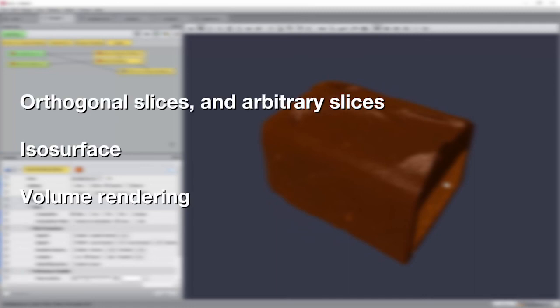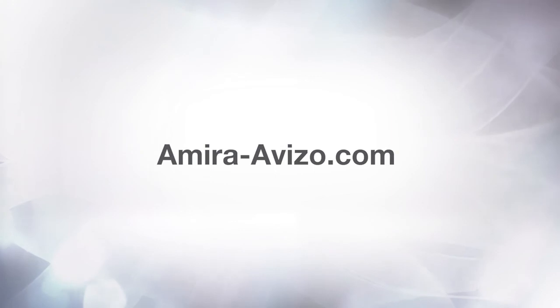As a summary, in this tutorial, you should have learned the basics of displaying orthogonal slices, isosurfaces, and volume rendering. Goodbye, and thank you for viewing this tutorial.